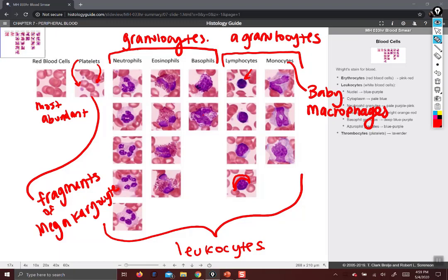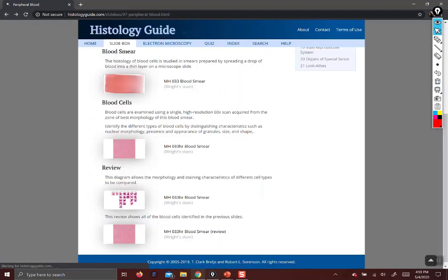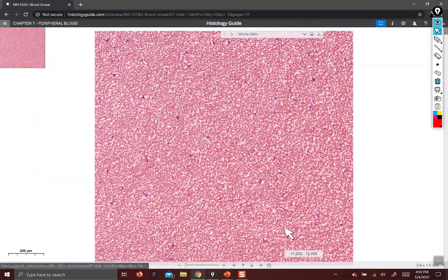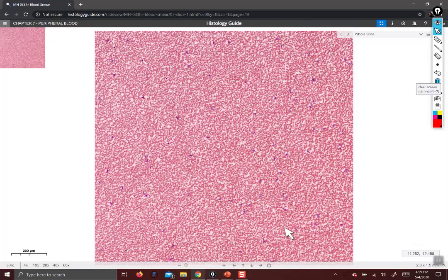That's a primer for what you can find in the blood. So let's actually go look at a blood slide now. When you look at blood with a low magnification, most of what you see is red blood cells — a lot of erythrocytes — and then you can see those purple guys, which are your leukocytes. Start at low magnification and scan around to see if you can detect any differences. This is a skill you'll develop.